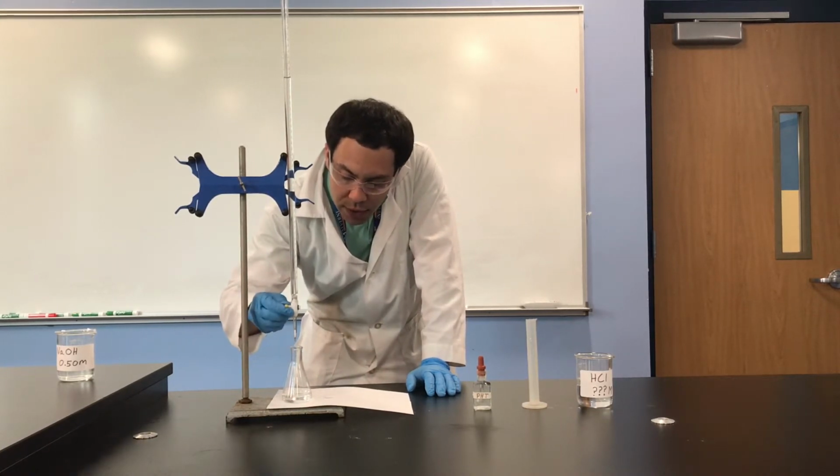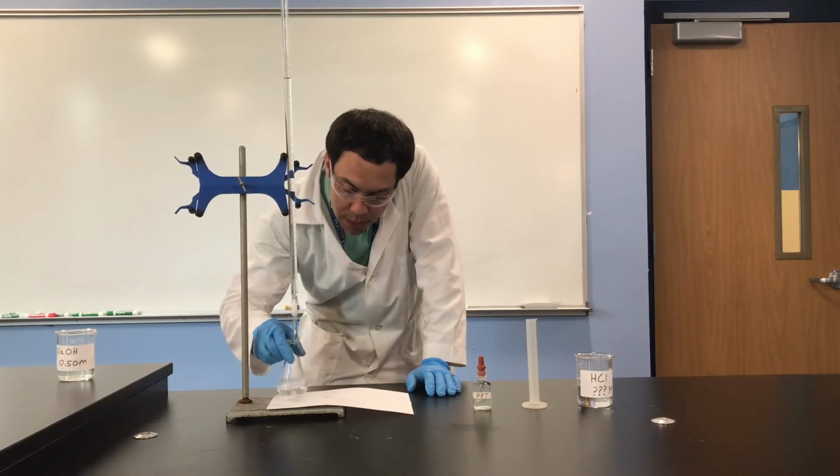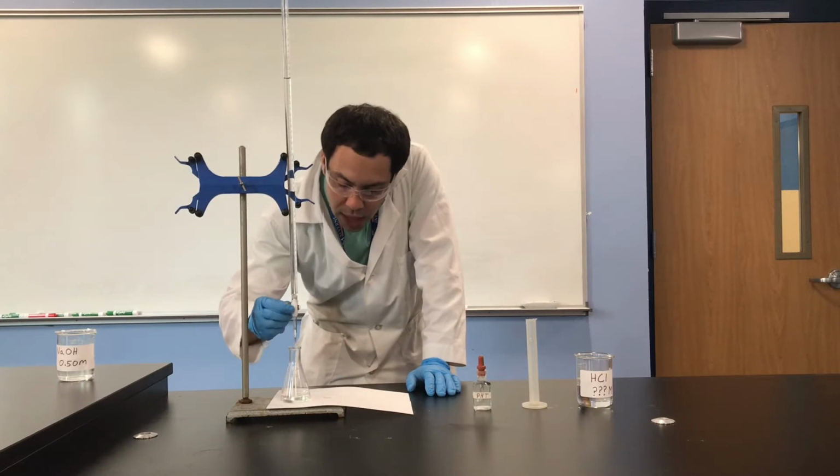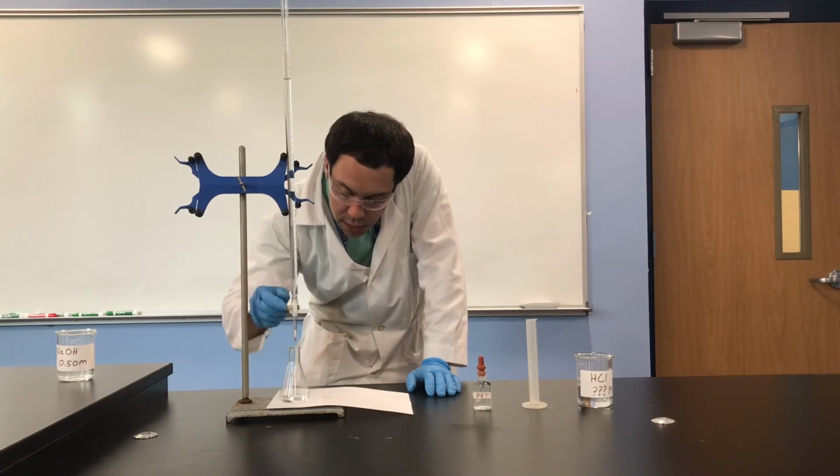So I'm going to very slowly put base in there and swirl. I need the pink to stay faint pink for about 10 to 15 seconds.